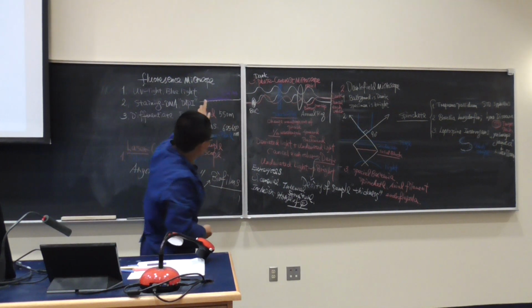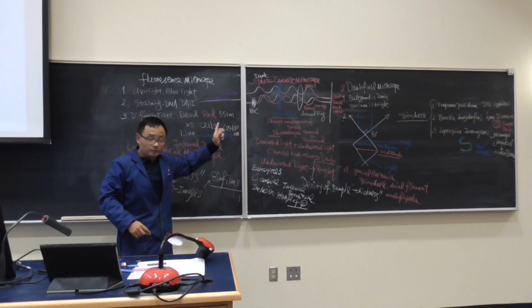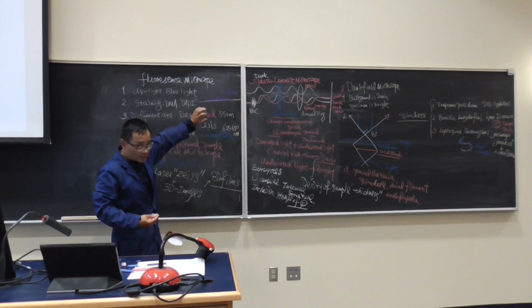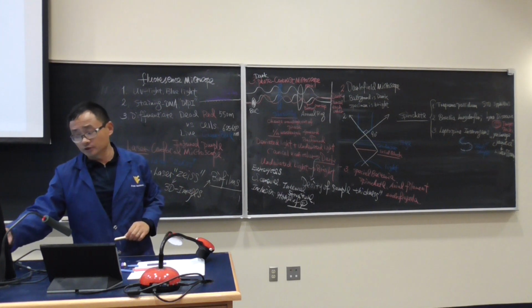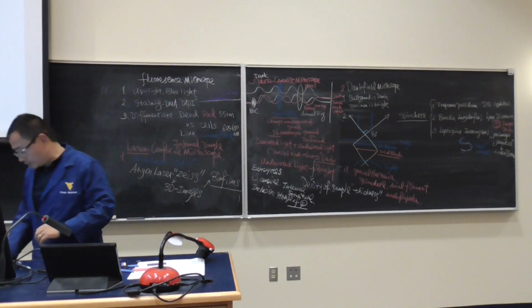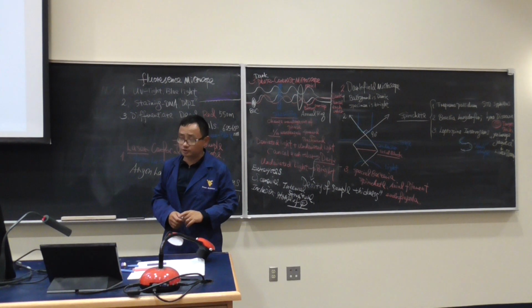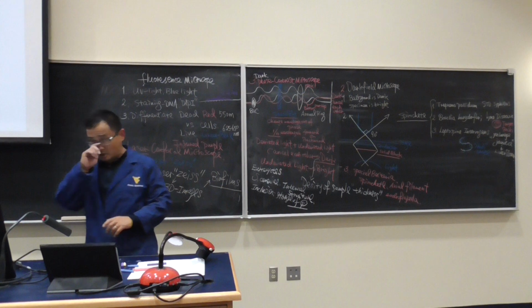Okay, you may not be able to see it, so I'm going to use the other color. That's a biofilm. Now we want to see the biofilm analysis. We want to see the width, the length, and also how high it is. That we need to use 3D images, so that's why we need to use the laser confocal microscope. I did this a long time ago when I was working in Maryland in the USDA Agricultural Research Service, as a research microbiologist almost 12 years ago, before I came to WVU. This is kind of the research I did myself.